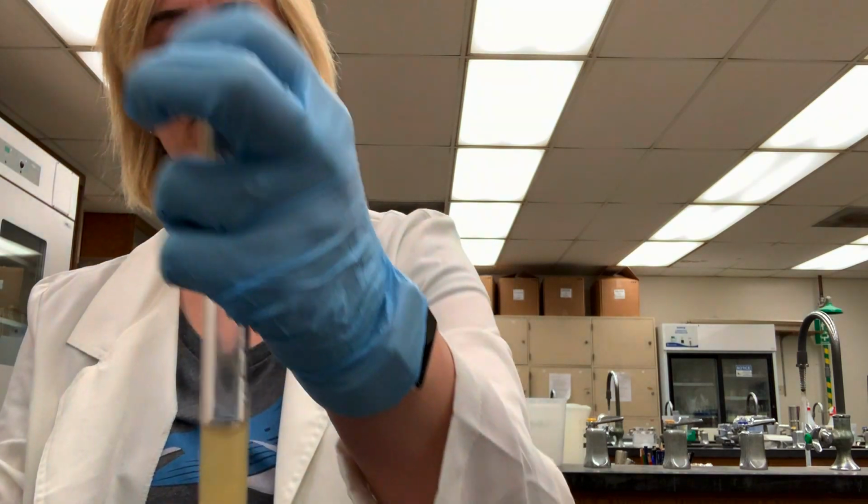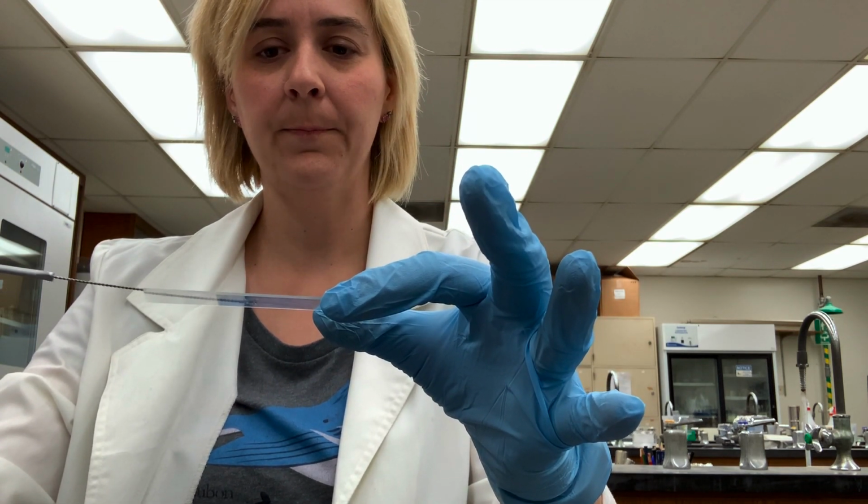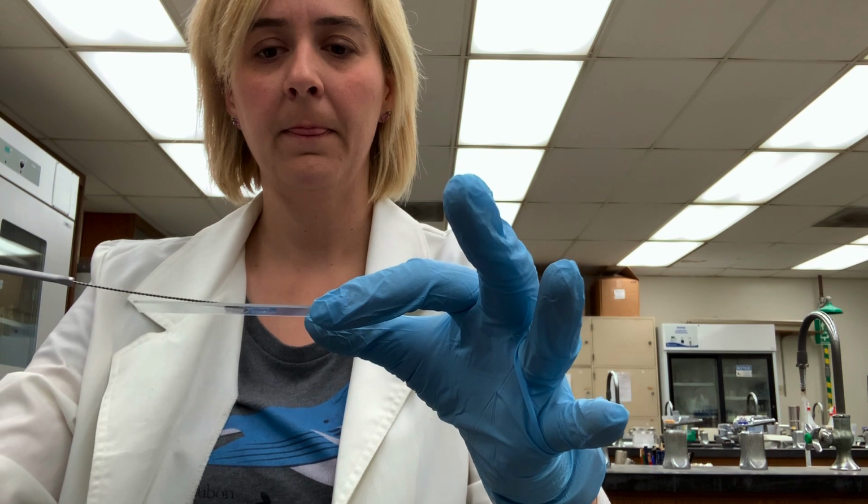Okay, so I've got my loop full of culture. I'm going to spread that loop full of culture on my slide. And then I need to let the slide air dry. So I'm putting it back on the rack. I'm going to sterilize my loop again.